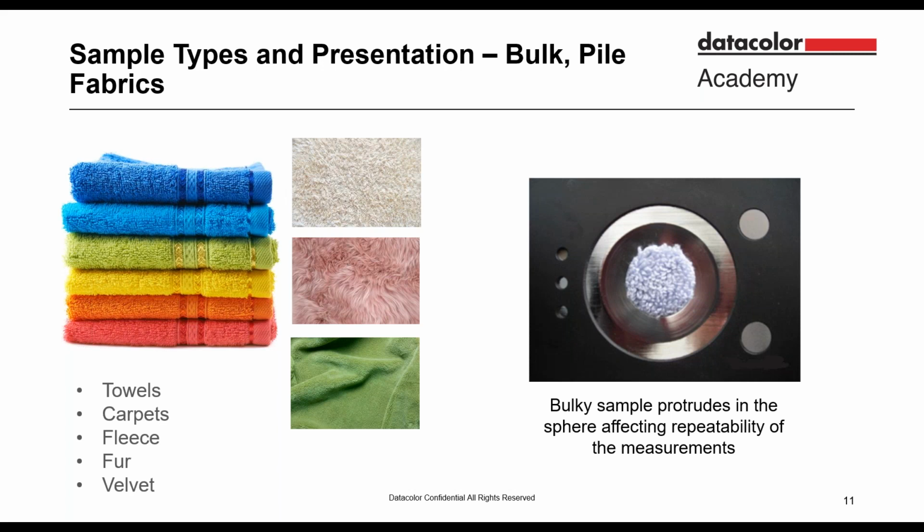You can start with 8 measurements and do the analysis, and if you maintain the value, you lower to 7 measurements, and if you maintain the value below 0.15, you can go down to 6, to 5, to 4, and so on. This will allow you to determine how many measurements you have to take of your sample.